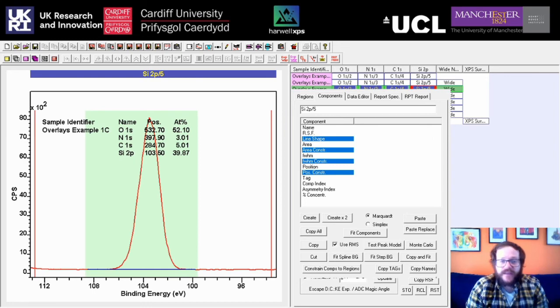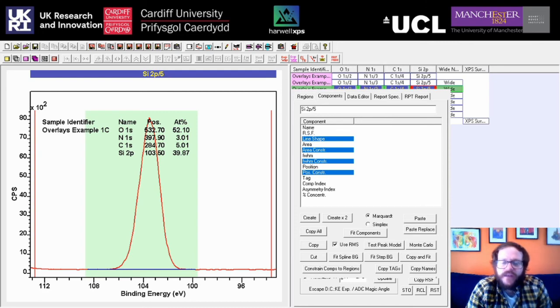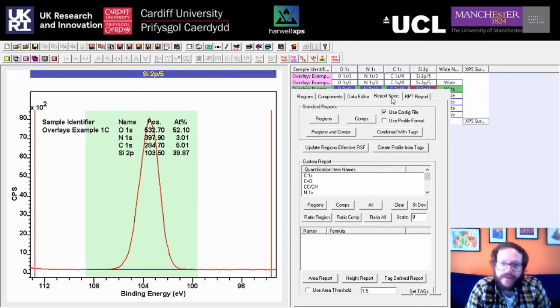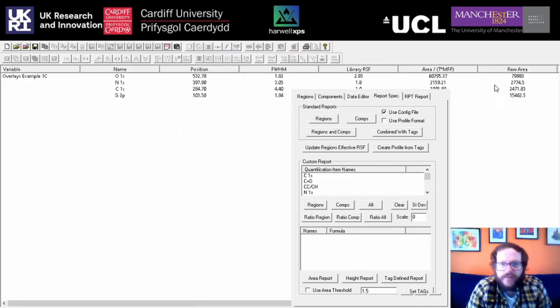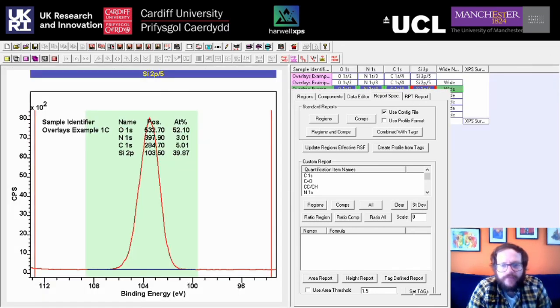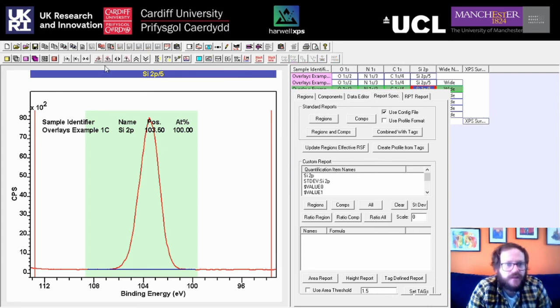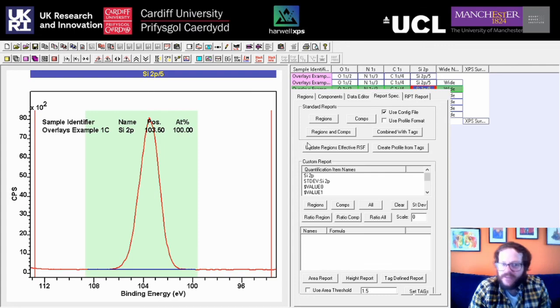Finally, we're going to cover how to export the data. For the quantification: select all of the blocks you've processed, go to Report Spec in the quantification window, and you'll get a standard report of your regions as a table. Use the Copy option to copy it to clipboard or save it as a text file. If you want to export the actual spectra themselves, there's an option called Save Tab ASCII to Clipboard — open that up and you can copy or save it as a text file, then put it into Excel to plot for your publications or reports.